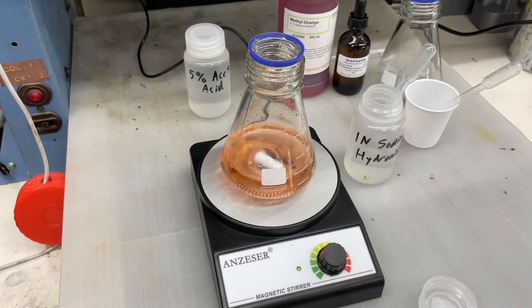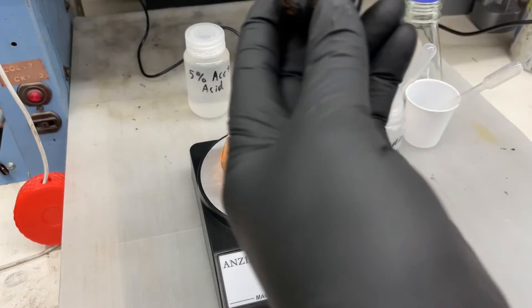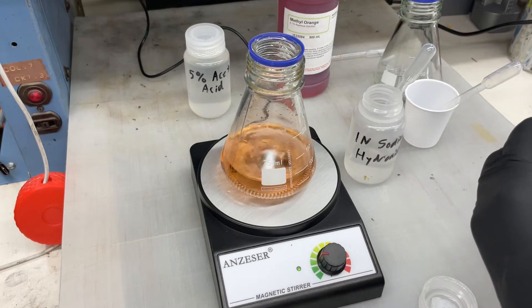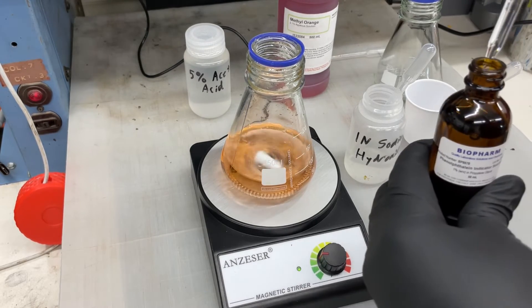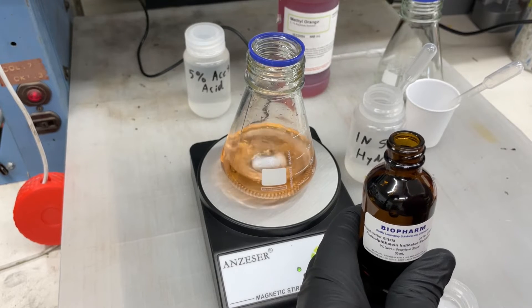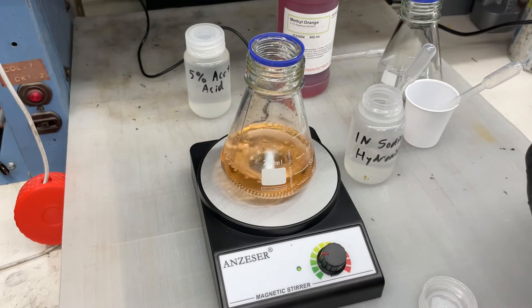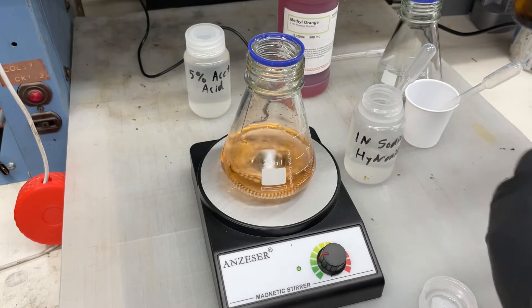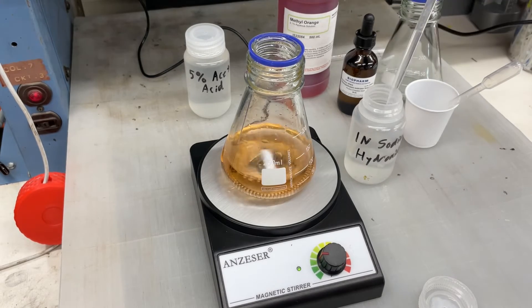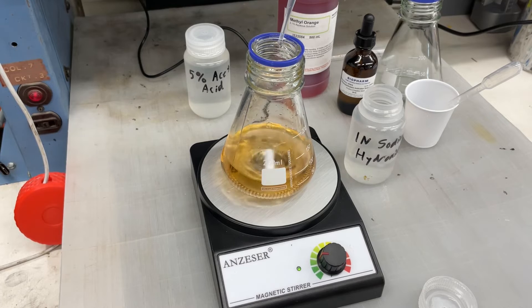Then after that, we're going to add 8 drops of phenolphthalein, and this is another indicator. We're going to continue our titration with the sodium hydroxide solution, and this one is going to tell us how much dissolved aluminum is in our anodizing bath.